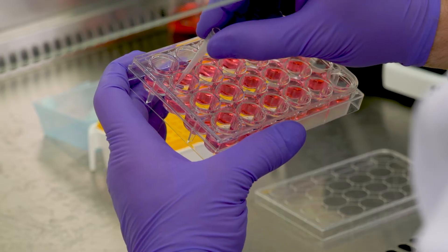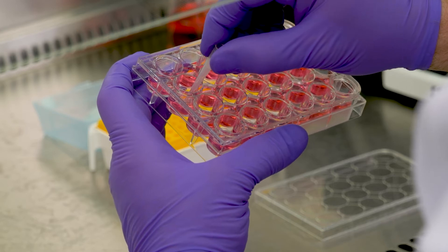Scratch wound creation is conventionally done by manually dragging a pipette tip through a cell monolayer. It's time-consuming and leads to highly inconsistent wounds that are difficult to analyze.